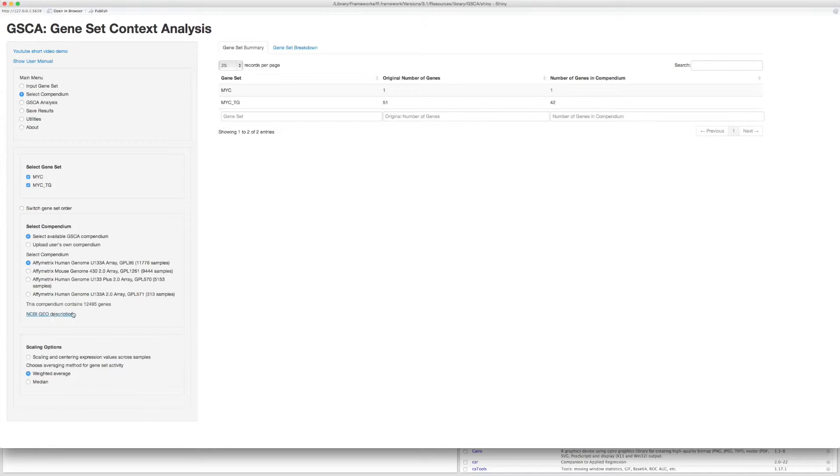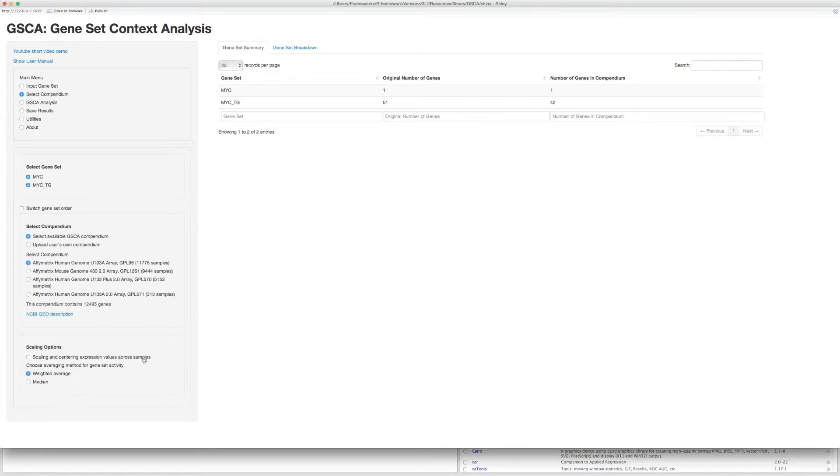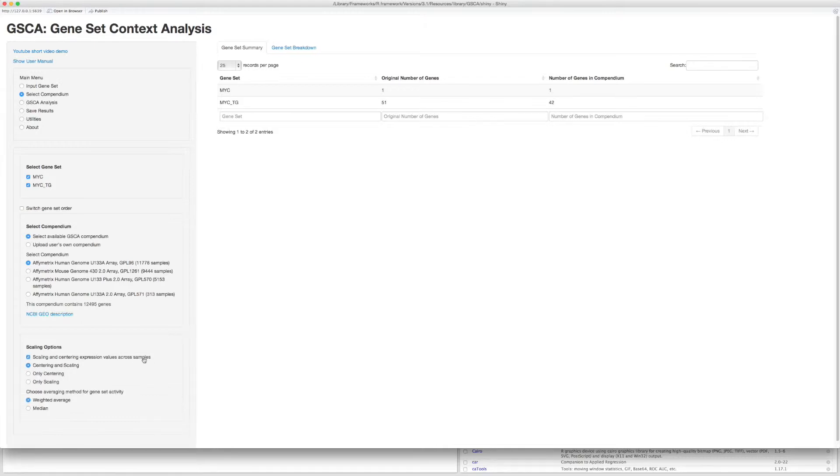For this study, we select Human HGU133A array. The table shows the original number of genes in the gene set as well as the number of genes included in the compendium. You can also check this option if you want to scale the gene expression values.